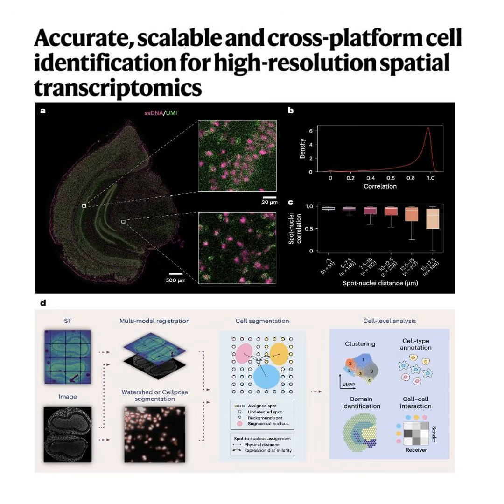So, N. Let's start with nucleus segmentation. Cellist starts by finding the anchors, the nuclei of the cells. Why start there? Because it gives the algorithm a definitive physical starting point. And Cellist actually offers two different backends for this, depending on what tissue you're looking at. Oh, interesting. Yeah, for standard tissues, it uses a traditional watershed algorithm. You can picture the intensity of the image like a topographic map. Oh, so the bright nuclei are like valleys. Yes, and the algorithm essentially simulates flooding those valleys with water to figure out where the dividing ridges are between them. It's incredibly efficient. Doesn't even need a GPU.